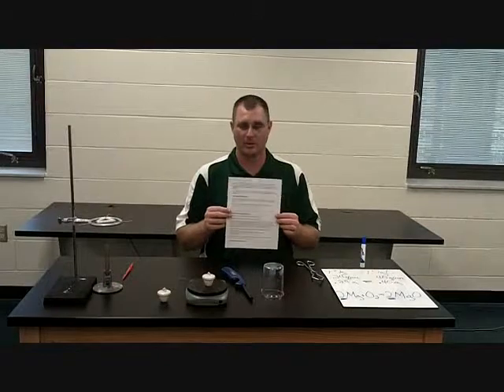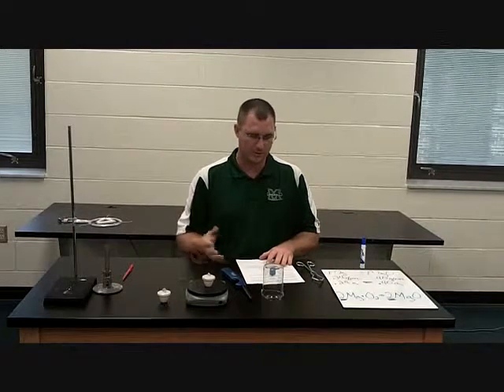Hey guys, today we're going to go over your Lavoisier Lab, and it is in chapter 3, and it primarily deals with the law of conservation of matter. So it's a really neat lab, and we're going to go through it here today. So if you missed it, you'll have an opportunity to see what it's about.